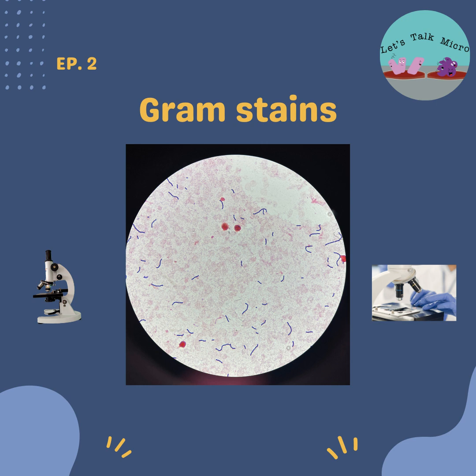So we got our sample. It came to the lab. We received it, we plated it in the agar, and then we make a smear out of it. What's a smear? It's basically you put a sample on a slide to be looked at in the microscope for bacteria. How do you do this?